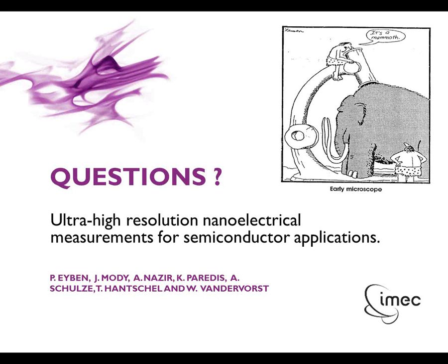There's maybe a related question on any tips for reducing noise when putting an SPM in a glove box. I certainly know we did quite a bit of engineering to make that work well. But maybe, Peter, you have additional comments there? Yeah, I think a lot of it is in the engineering.